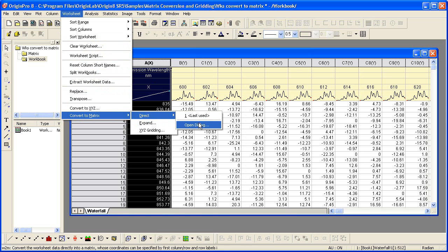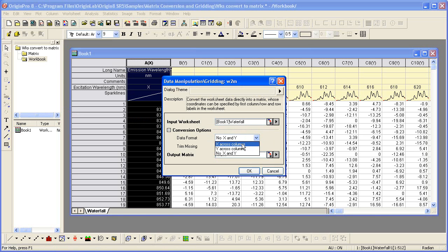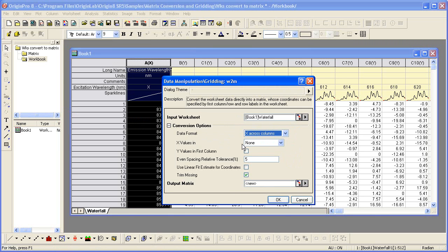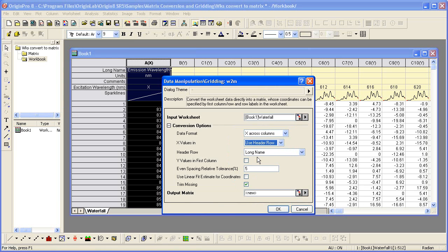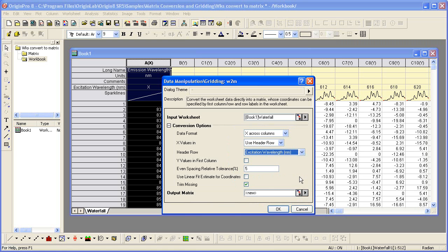The other options, such as the XYZ gridding, will be used if your data is in a different form, such as just three columns designated as X, Y, and Z. In the conversion options, I will change the data format to X across columns since our X values are in the excitation wavelength row. So we specify that the X values are in a header row, and that header row is excitation wavelength. So this drop-down list will show you all the column label rows available for you to choose.